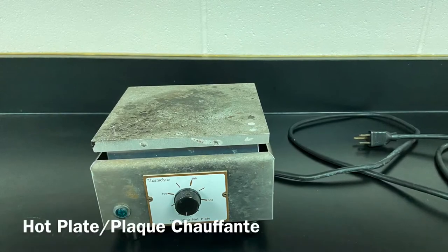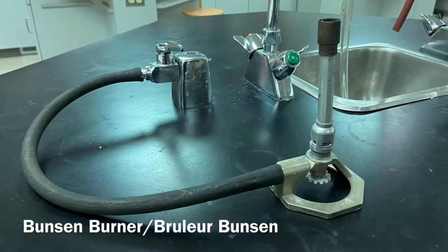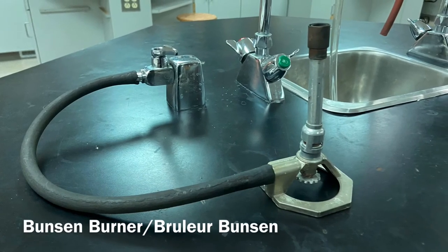Hot plate. Plaque chauffante. Bunsen burner. Brûleur Bunsen.